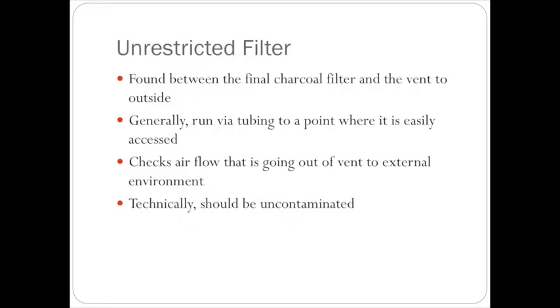The unrestricted filter is basically put in place between the last charcoal filter in the fume hood and the vent to go outside. So technically we should have completely cleaned the air, and then we're getting ready to shove it outside. And so we want to be able to evaluate if that is really clean.